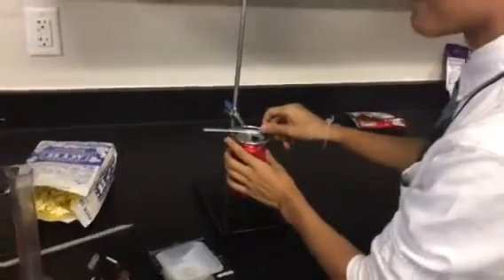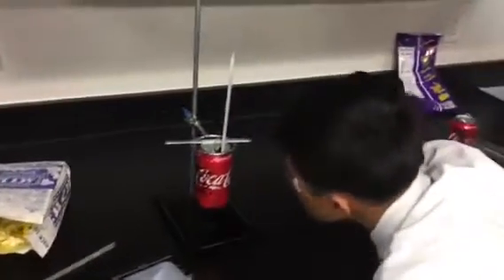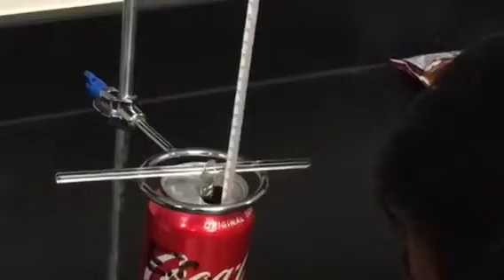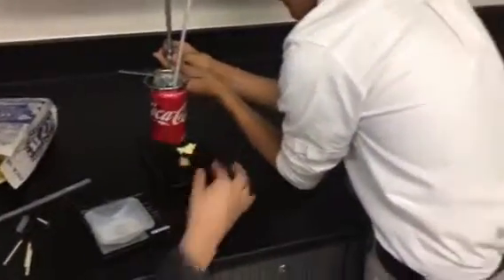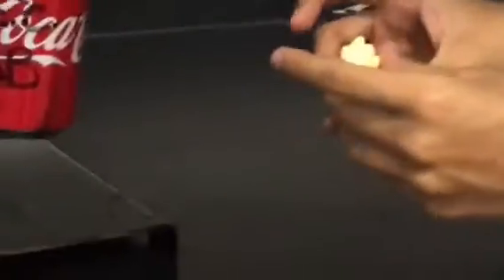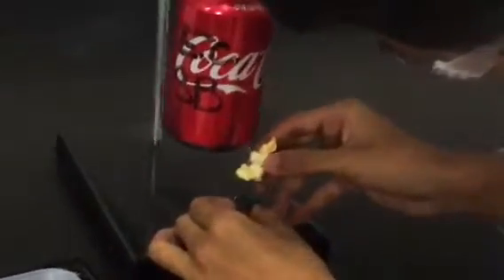Yeah, I'm gonna put it like that, right? Okay, and then put the thermometer in. 23 degrees Celsius. Yeah. Okay, now we're gonna light it. Oh snap! Too far. This is exactly 50 milliliters. That means it has energy inside.